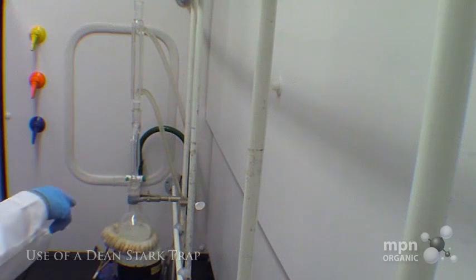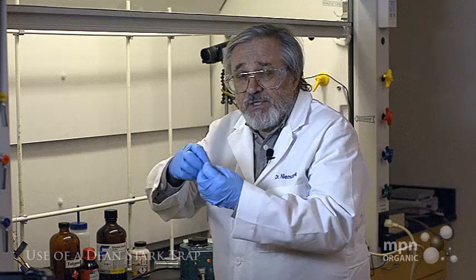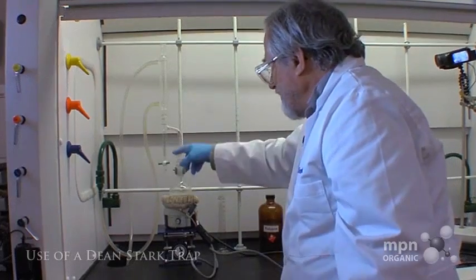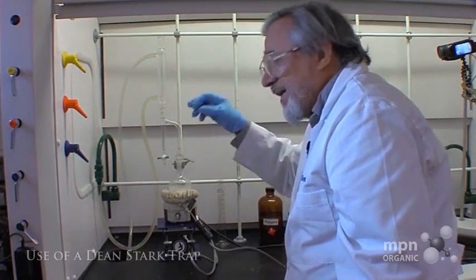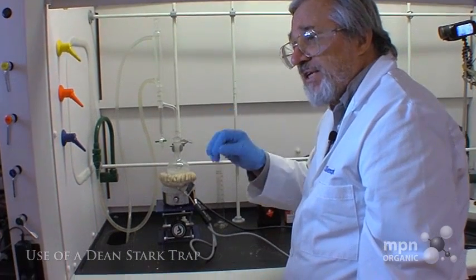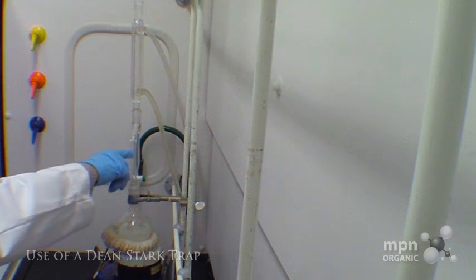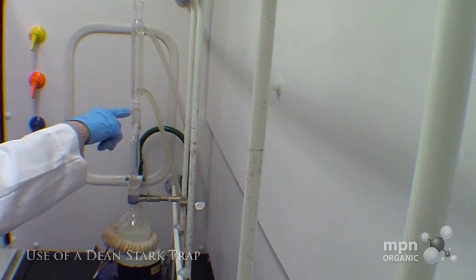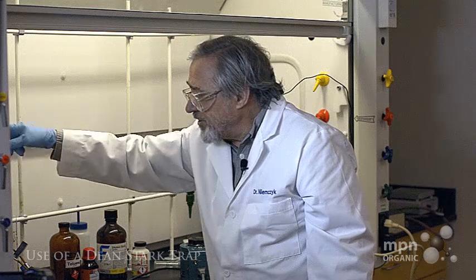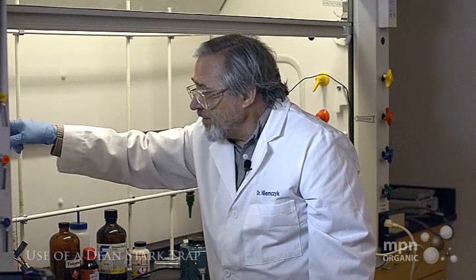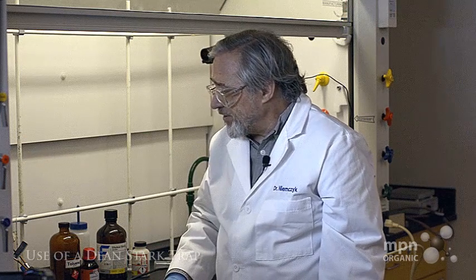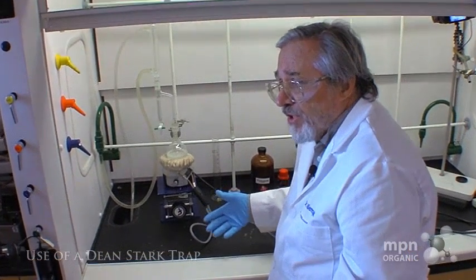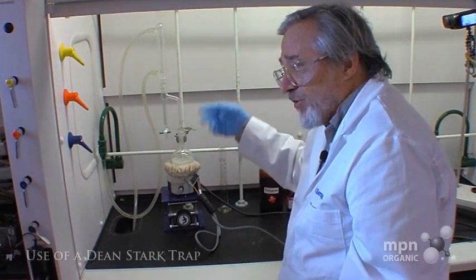But as soon as it cools down to room temperature again, the toluene and the water, which are mutually immiscible, will in fact separate, and you should be able to see that over here. Since toluene is less dense than water, the water is going to collect in the test tube down here, and the toluene will be on top. You'll get a continuous removal of water as the reaction proceeds, and more water is formed up to the point where you exhaust all the water in the reaction.